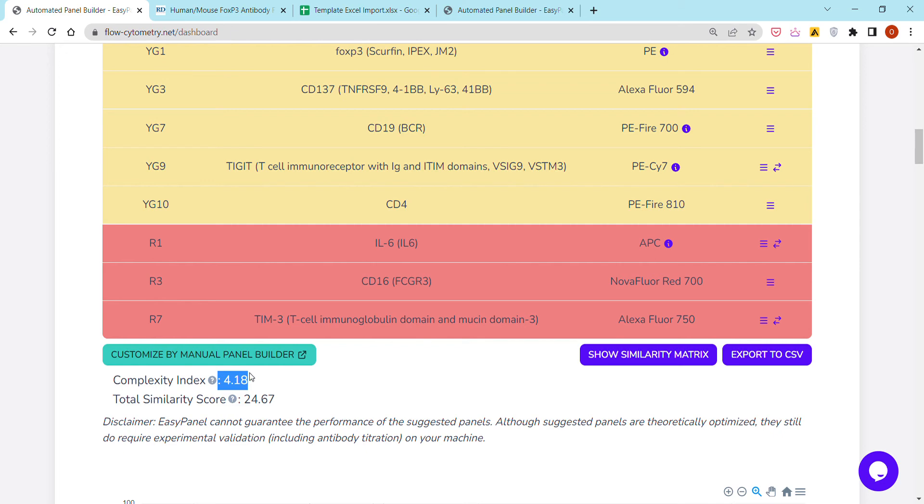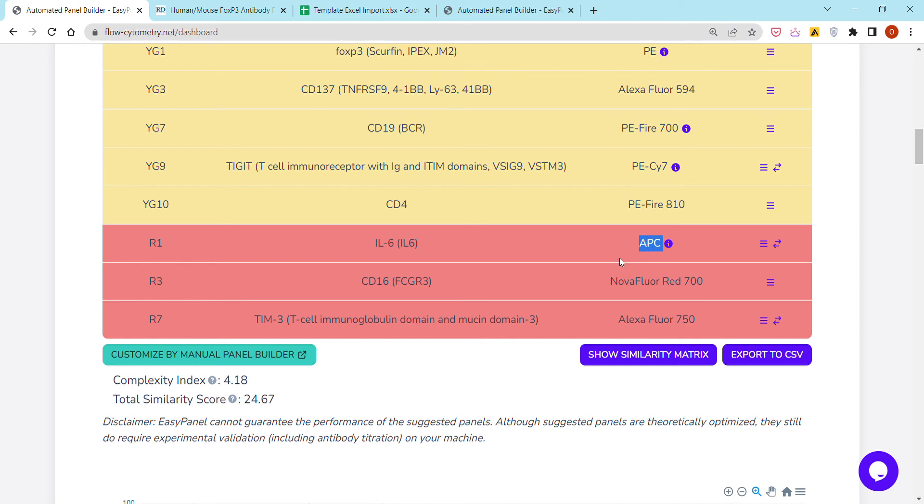Hence the panel optimization. But this is not the only criteria for our panel optimization. We also try to match antigens to fluorochromes in such a way that takes into account antigen expression level, antigen co-expression profile, and match them judiciously with the best possible fluorochromes.